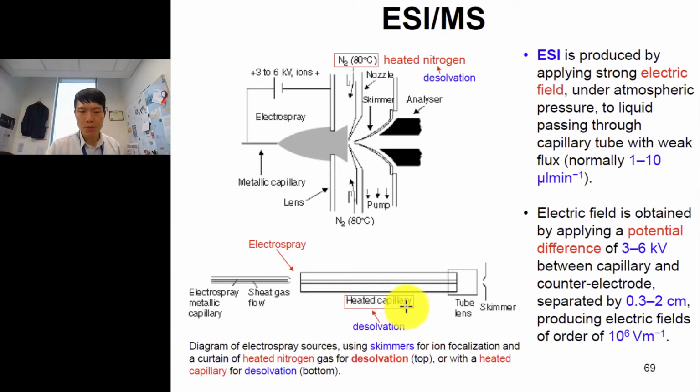We have to have the capillary heated, because if it's not heated, the droplets will tend to aggregate together. So in a way, we're trying to preempt it to separate when it's exiting. We can of course do heating at the end before the nebulizer, but we want to preheat it so that the energy is getting it ready. When it exits, it just shoots out, coming not just from charge repulsion, but from having enough kinetic energy inside.